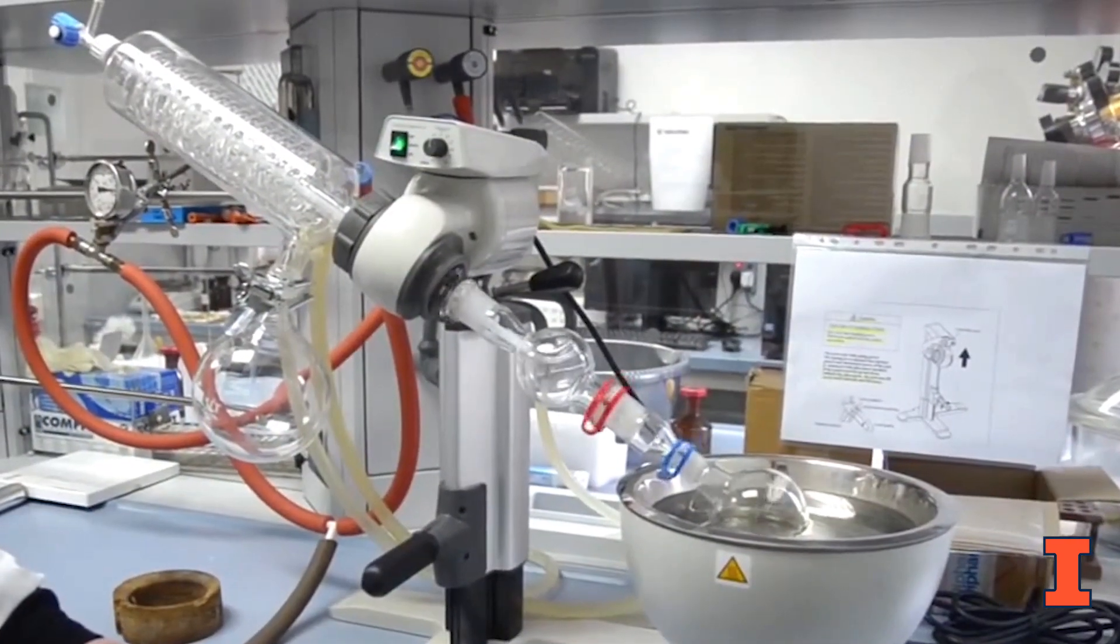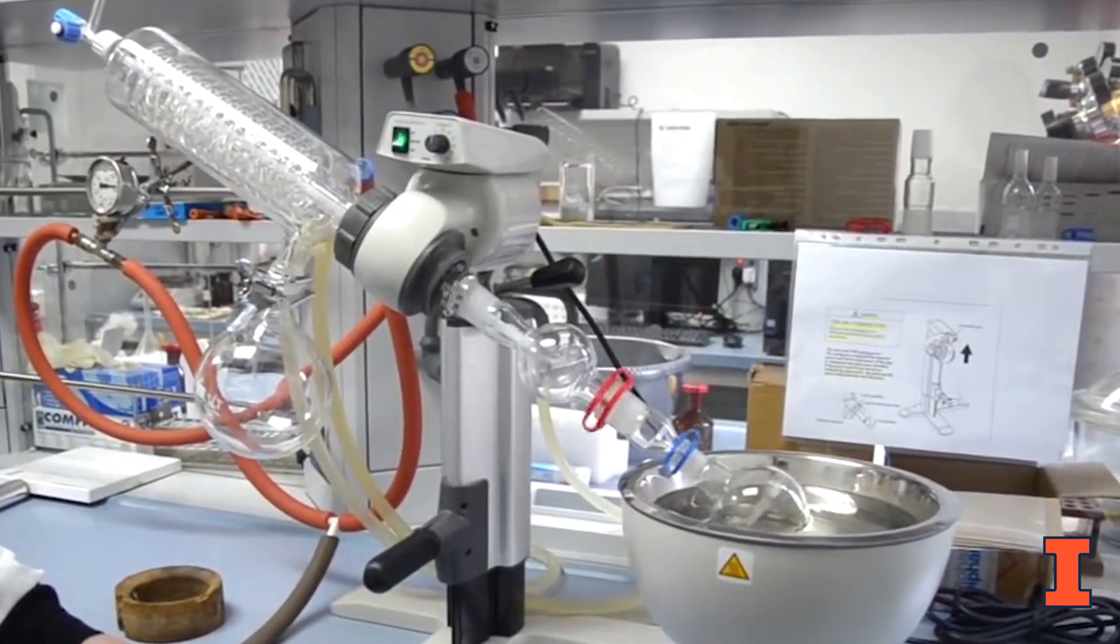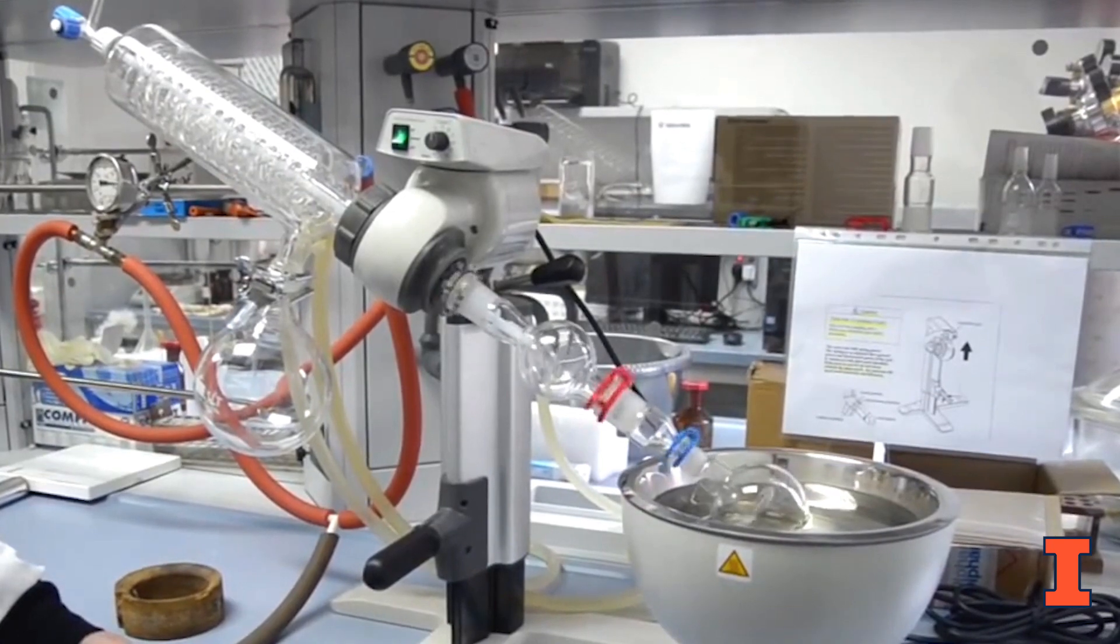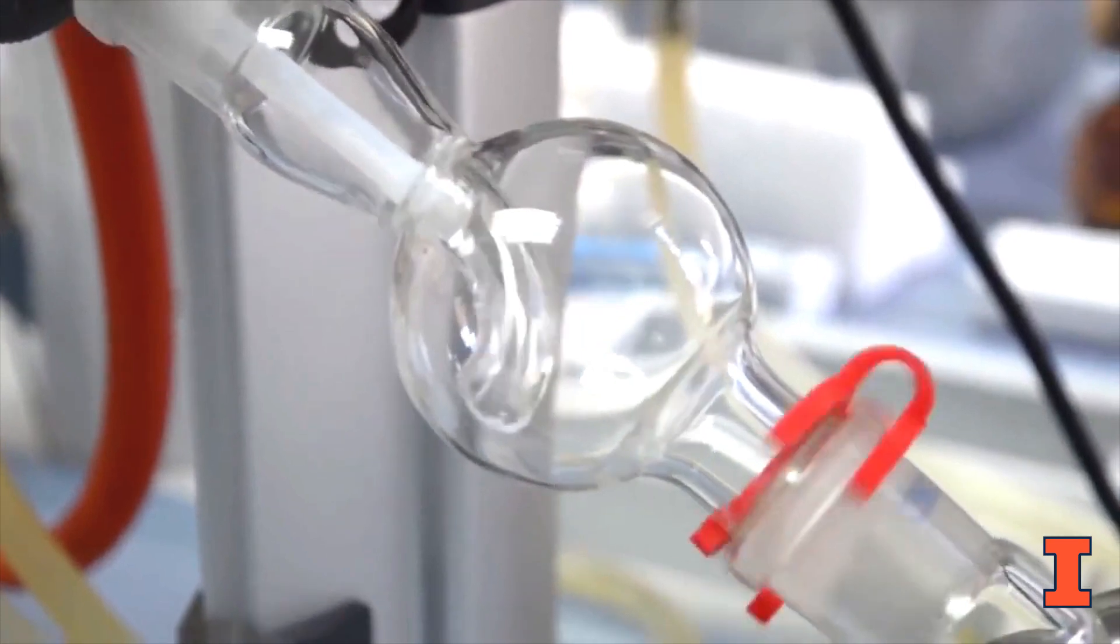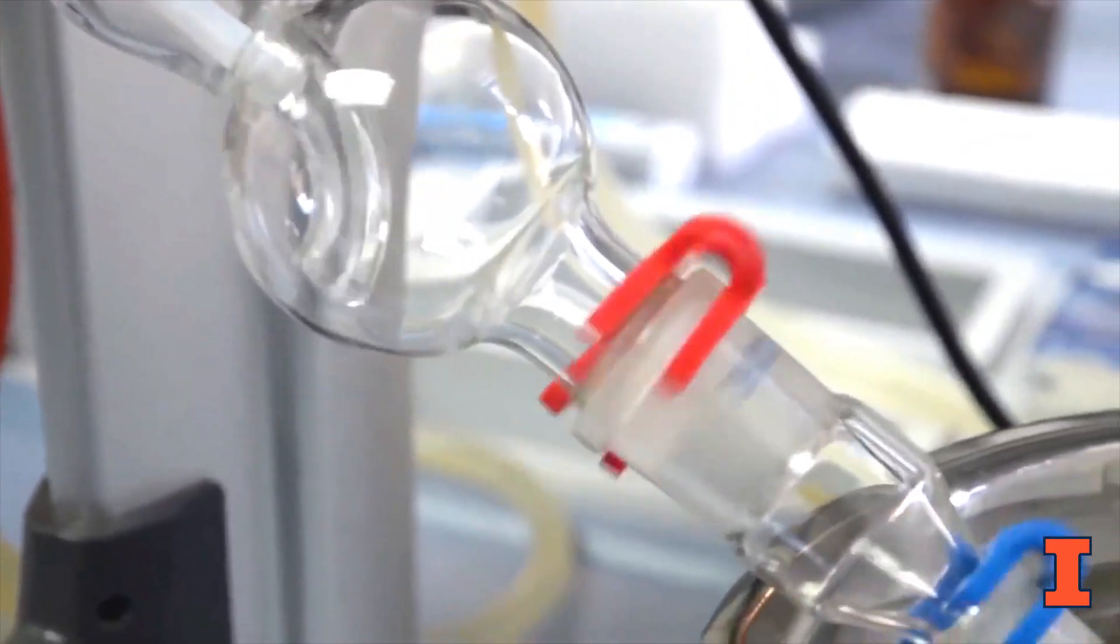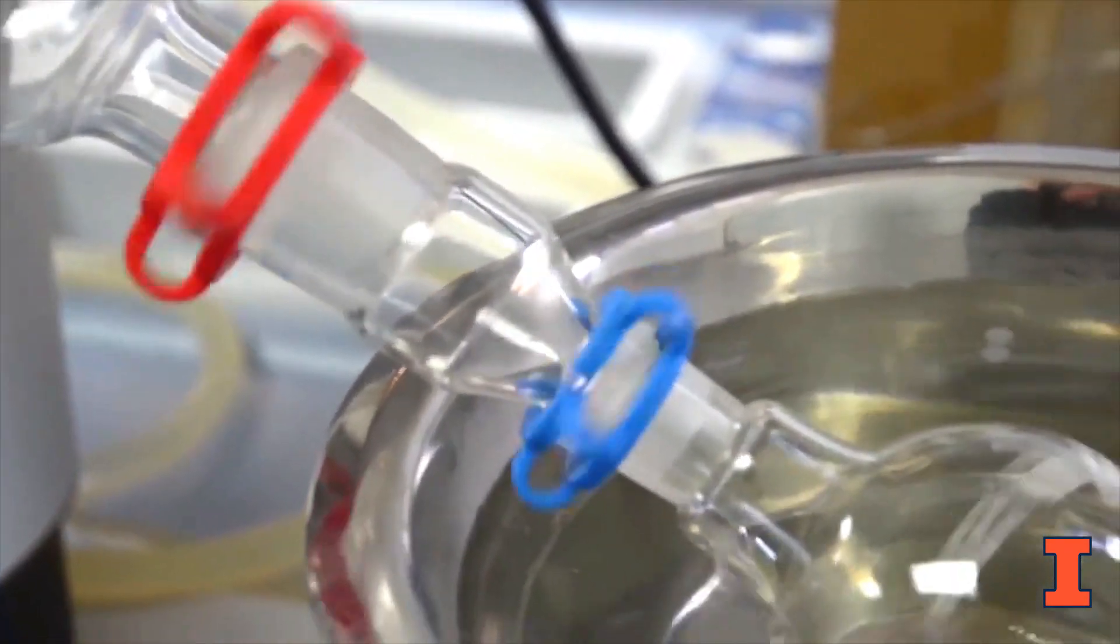Before distilling any peroxide forming chemicals, always test to ensure that there are no peroxides present. Never distill peroxide forming chemicals to dryness. Leave at least 10 to 20% in the still to help prevent possible explosions.